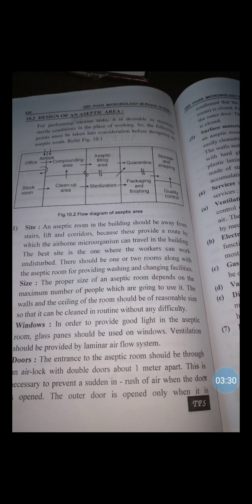First, that is site. This is important. An aseptic room in the building should be away from stairs, lifts and corridors. Why? Because this provides a route by which airborne microorganisms can travel in the building.